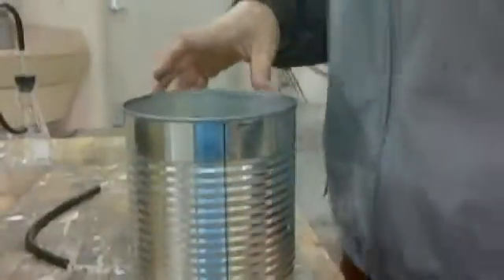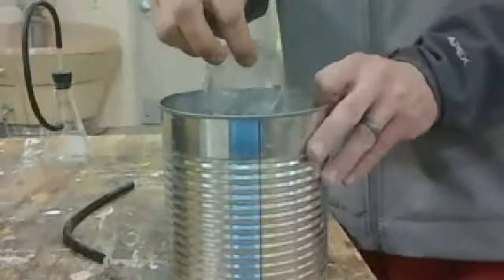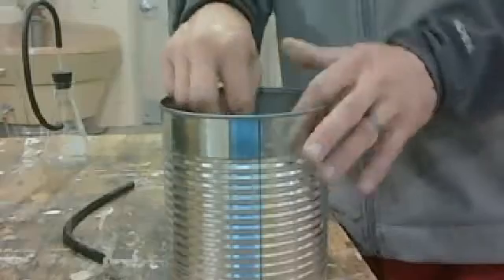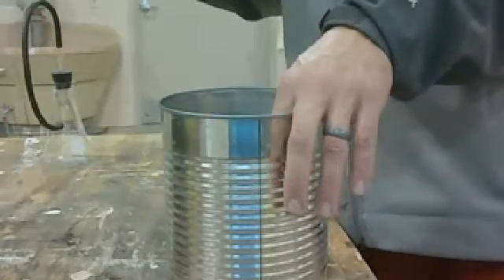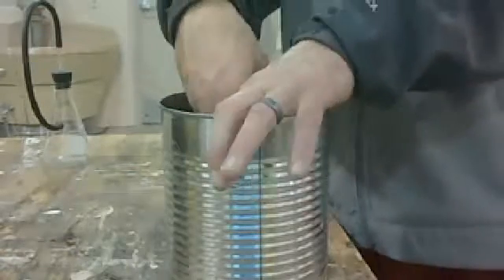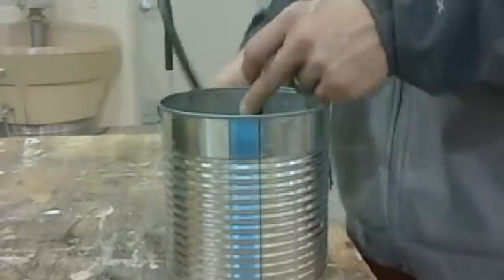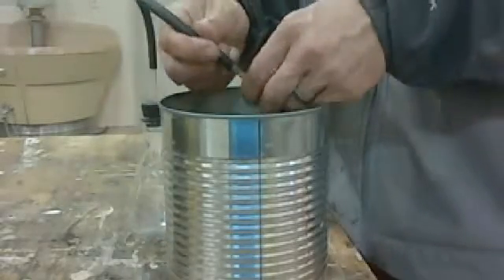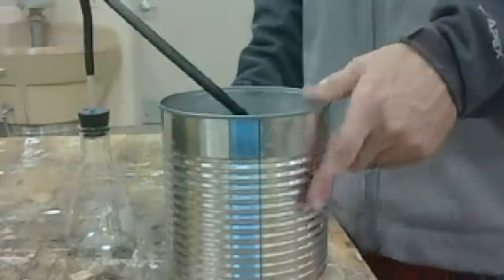What you'll do is take a beaker and place the beaker inside of the water. You'll then take a tube that was given to you and place it inside the beaker. Flip the beaker upside down, put the tube inside of the beaker, then take the other tube that is hooked to the Erlenmeyer flask and put those together. It will look like that.